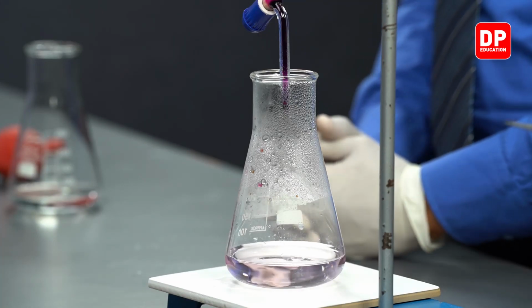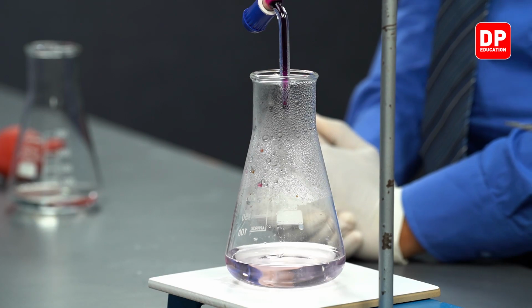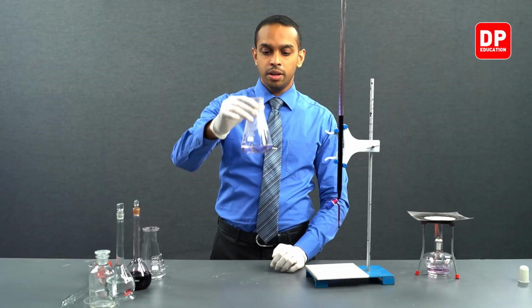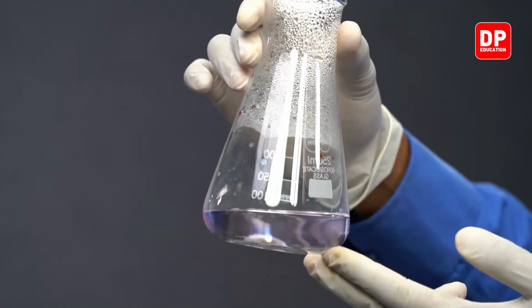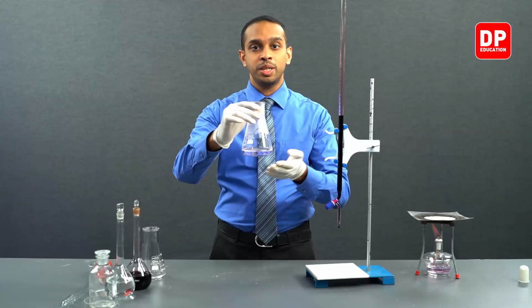Students, now you can see that the color of this solution is a permanent pink color. So this permanent pink color again is due to reaching the end point of this titration. Now all that is left for us to do is take the burette reading over here.